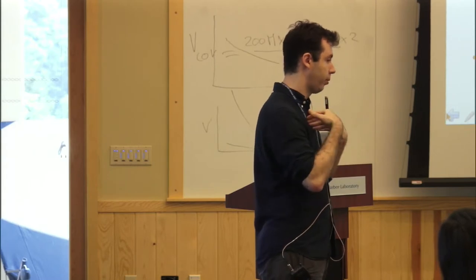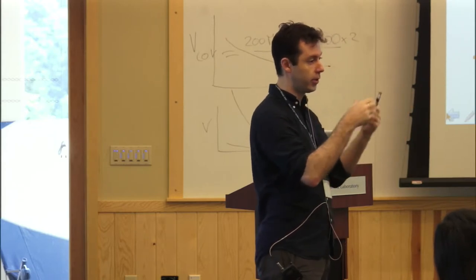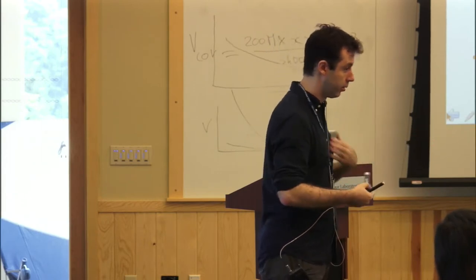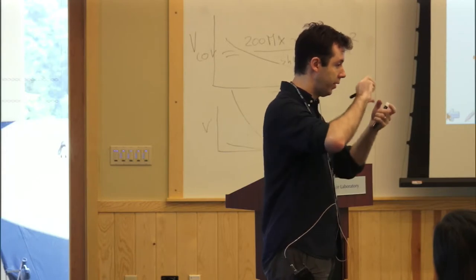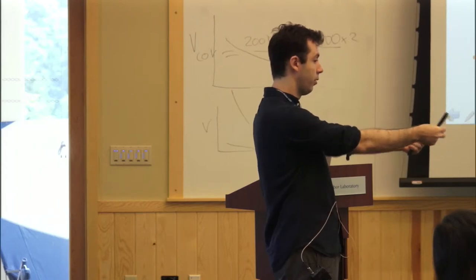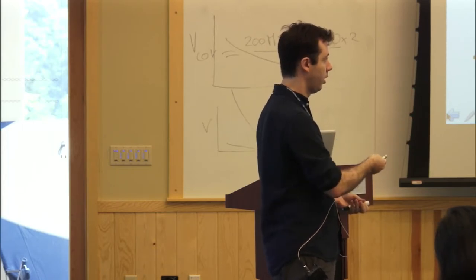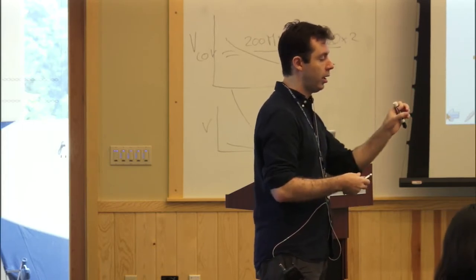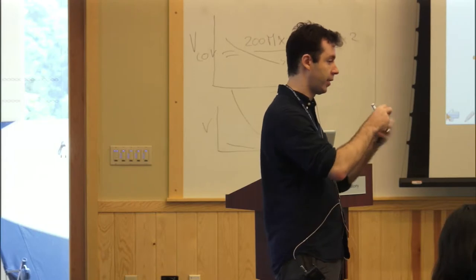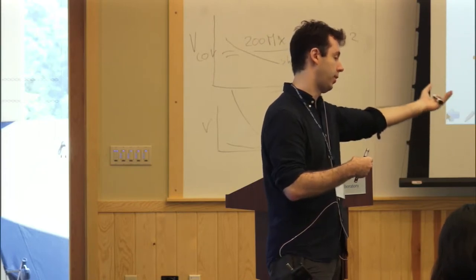Right? So I'm going to take reads coming from my genome. I'm going to align them to the reference genome. The reference genome is a consensus of several individuals. Right? So the reference genome is going to be different from my genome. So I'm going to take reads from my genome that have this insertion of one CA. I'm going to map it to the reference genome that doesn't have this insertion. It's going to be a difference. That's an indel. That's a short indel. And so the alignment tool is going to have to identify the fact that there was one CA insertion in my read that's not in the genome. And that's basically what some of these tools are doing.